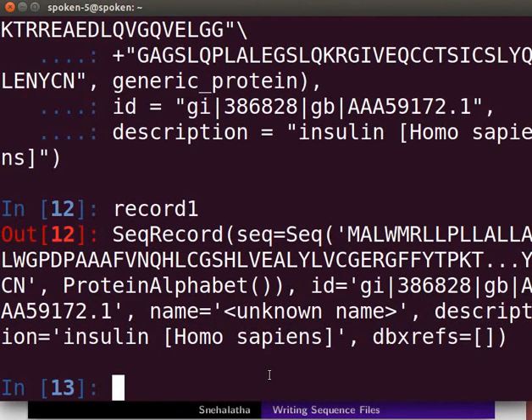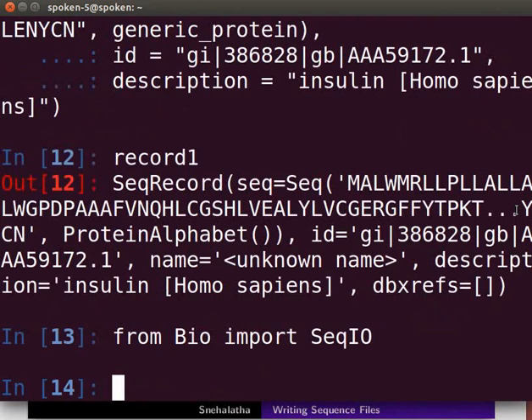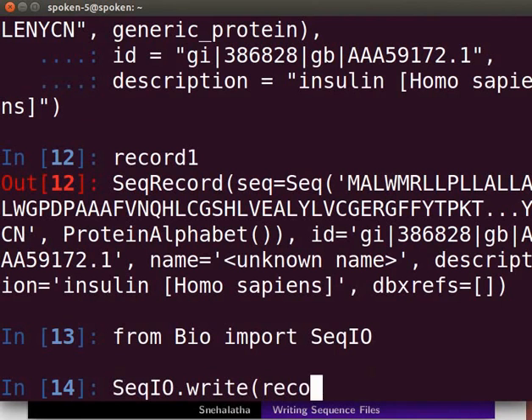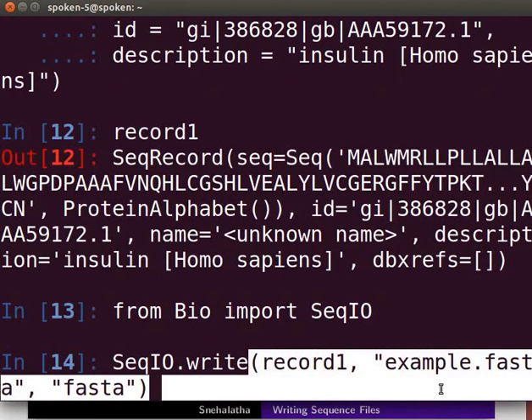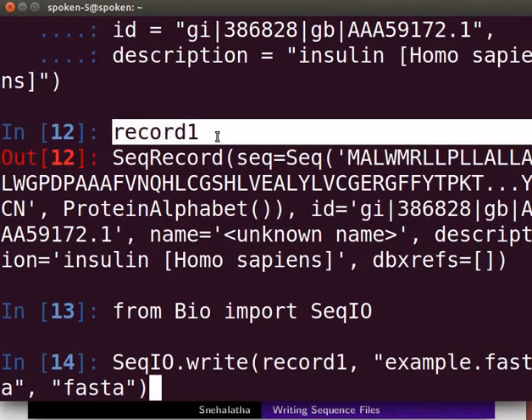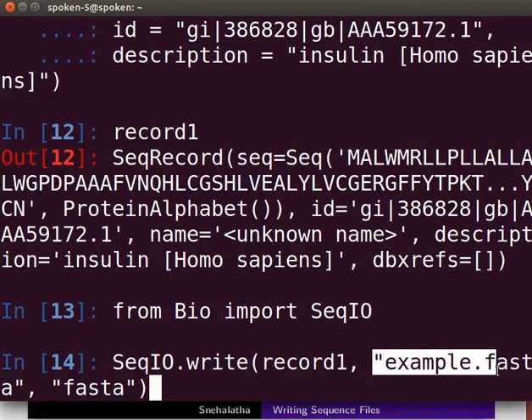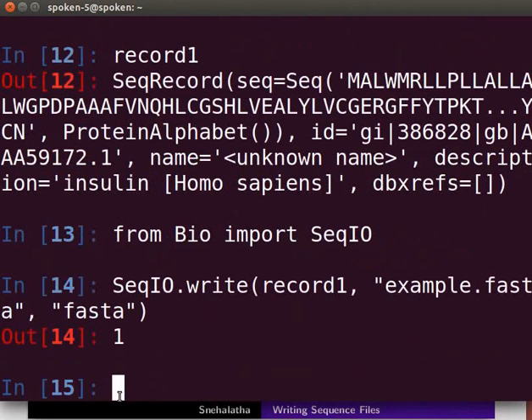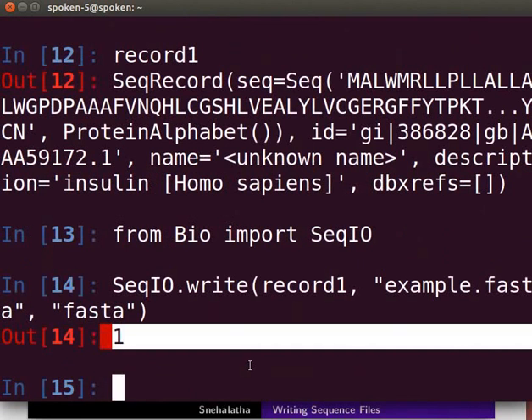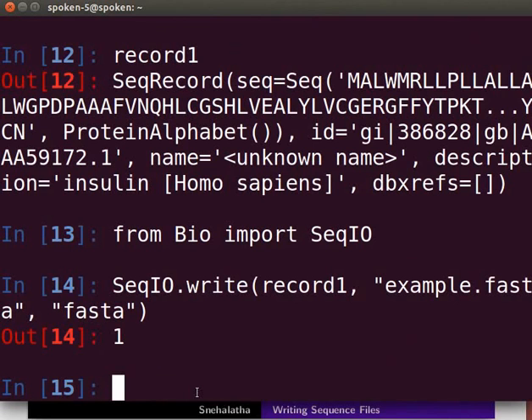We will use the write function to convert the above sequence record object to a FASTA file. Import the SeqIO module from the Bio package. Next, type the command line with the write function to convert the sequence object to a FASTA file. The write function takes three arguments: the variable storing the sequence record object, the file name to write the FASTA file, and the file format to write. Press Enter. The output shows 1, meaning we have converted one sequence record object to a FASTA file. The file in FASTA format is saved in the home folder as example.fasta.